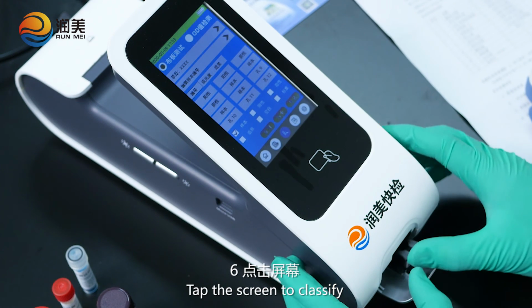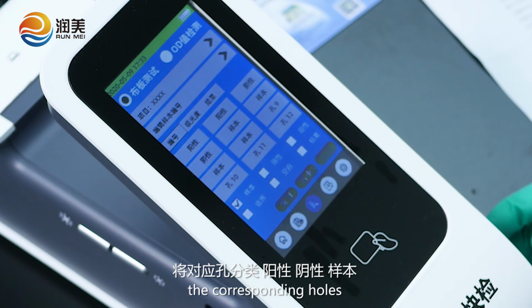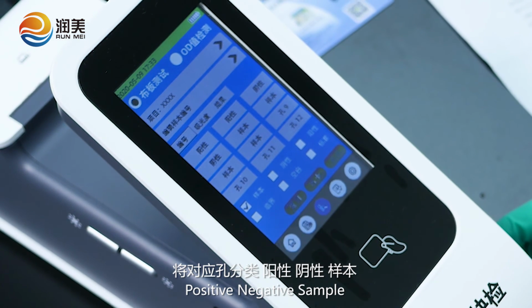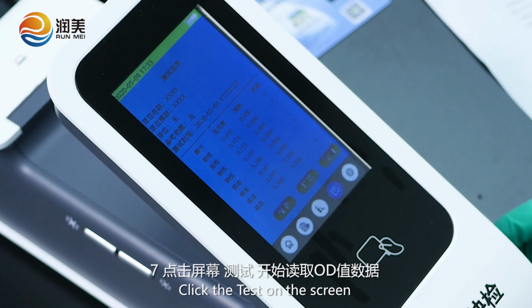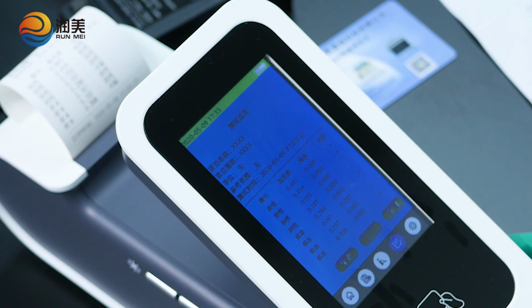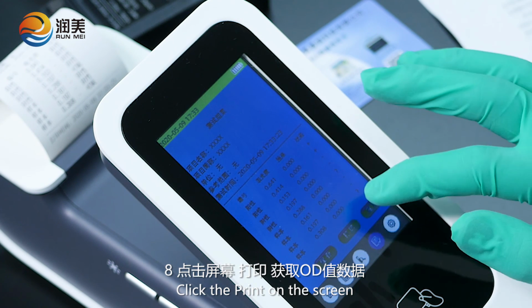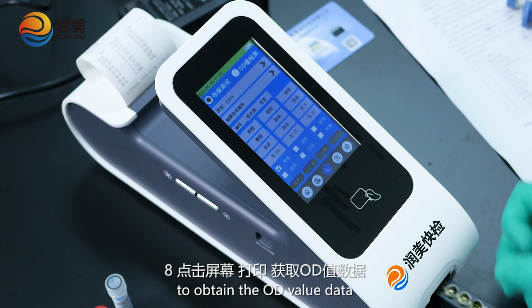6. Tap the screen to classify the corresponding blank, positive, negative, sample. 7. Click Test on the screen to start reading the OD value. 8. Click Print on the screen to obtain the OD value data.